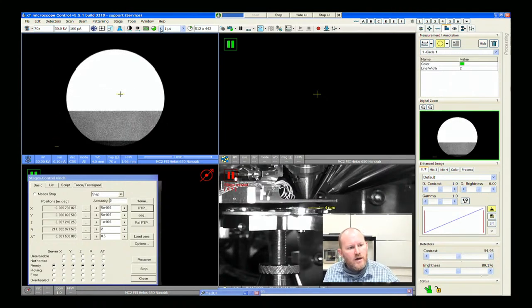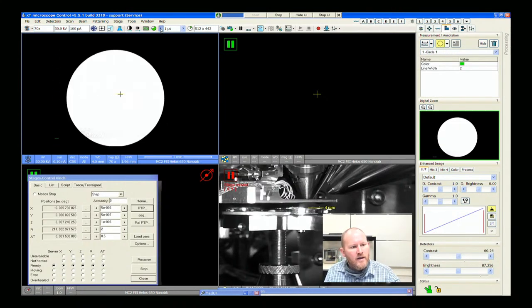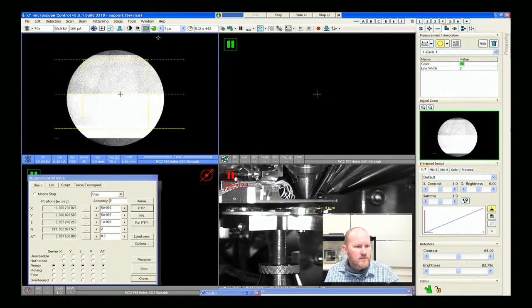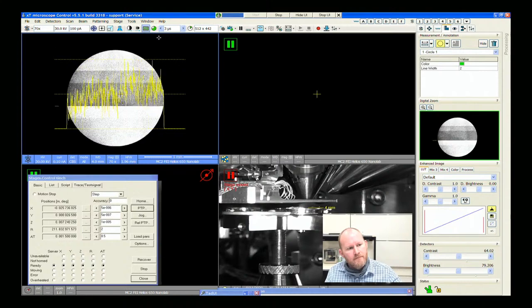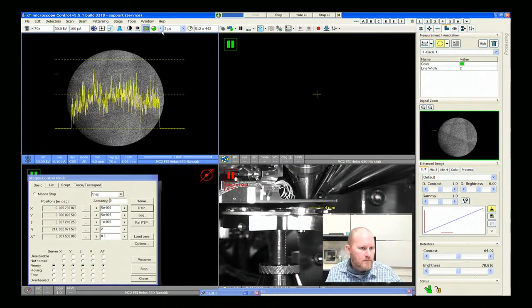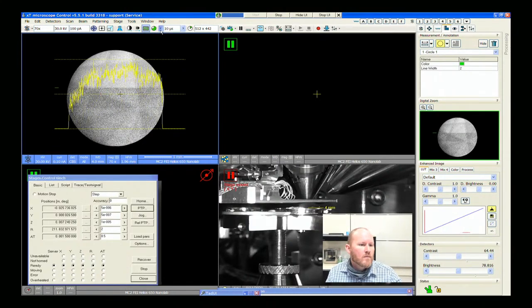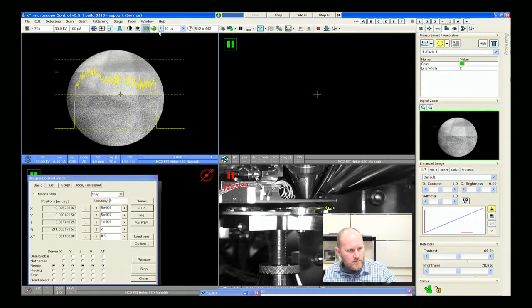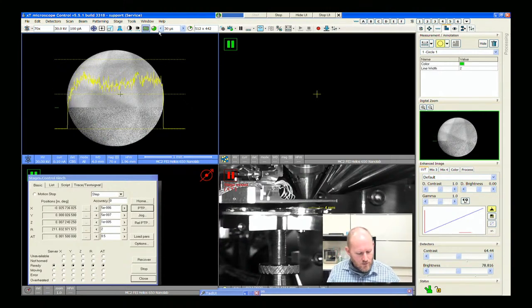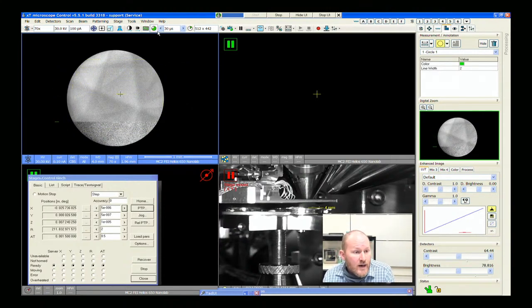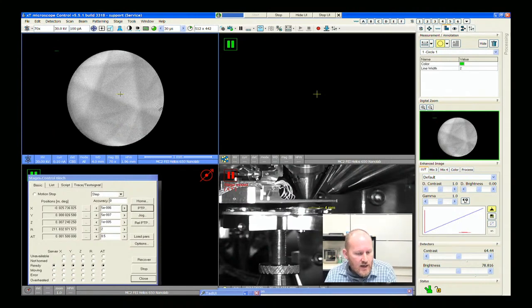Now we're going to need to turn our contrast up and our brightness down — and there, our pattern is starting to come back out. Let's look at the video scope. Okay, so that basically is how we create a SACP from scratch.